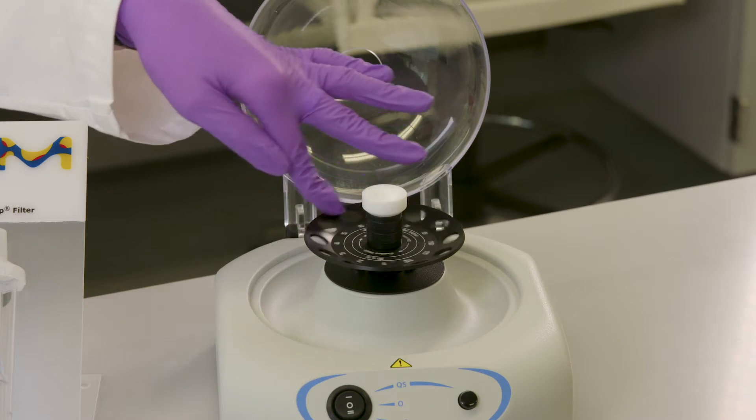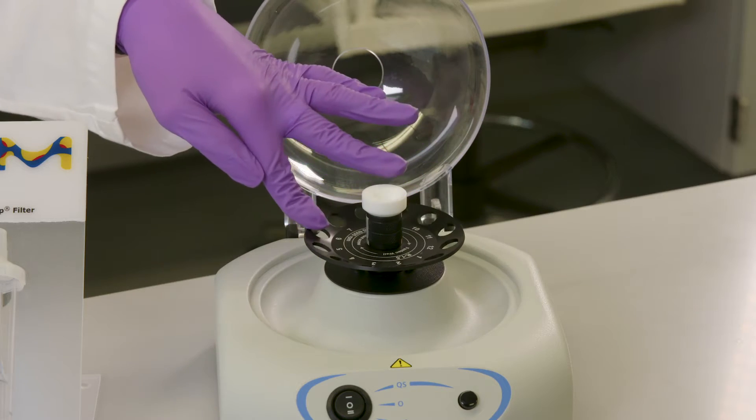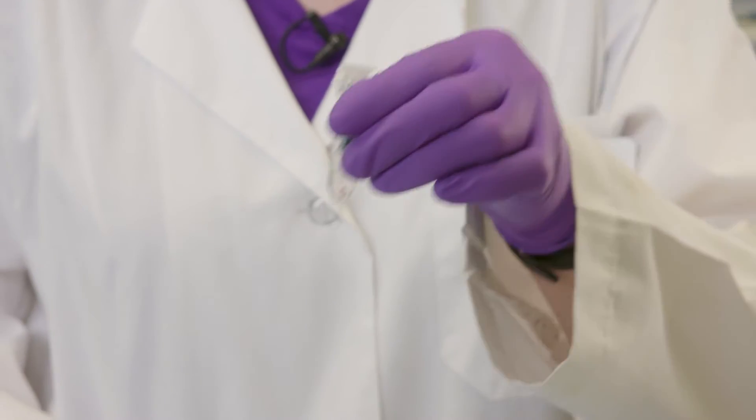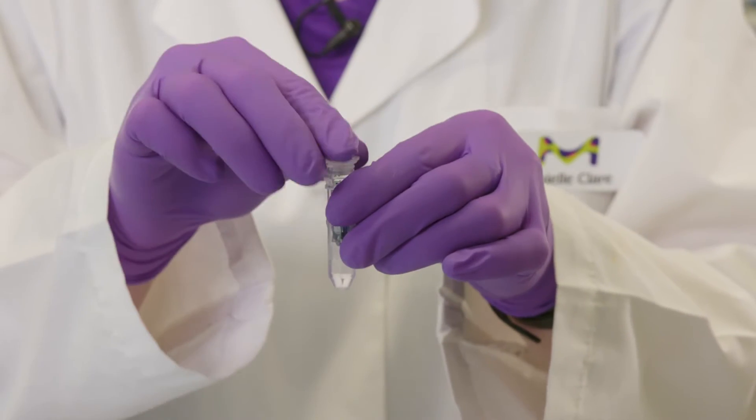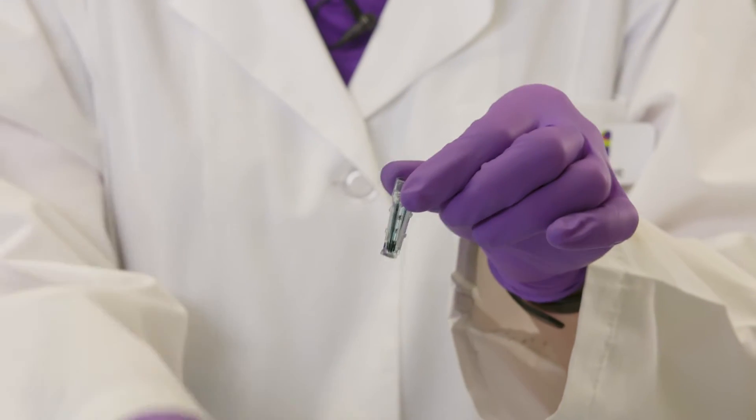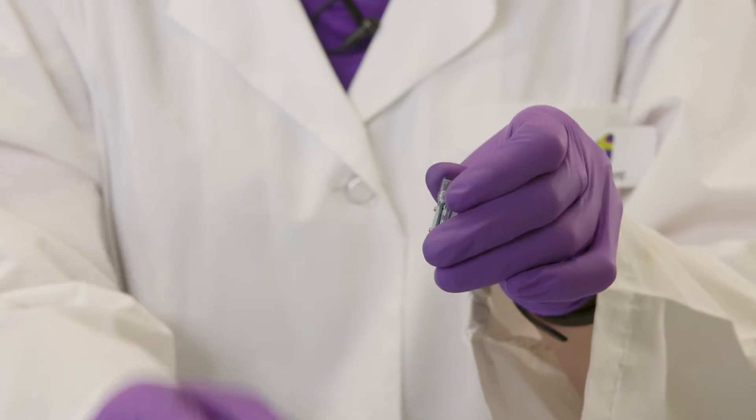Let me say up front that a reverse spin is not reversing the direction of the spinning centrifuge. It simply refers to inverting the concentrator into a collection tube and centrifuging again to get every drop of precious concentrated sample into the collection tube.